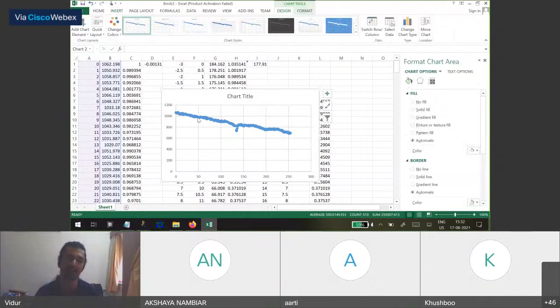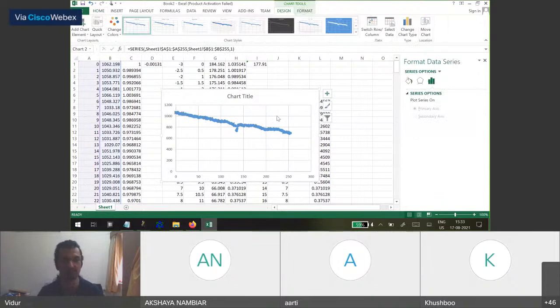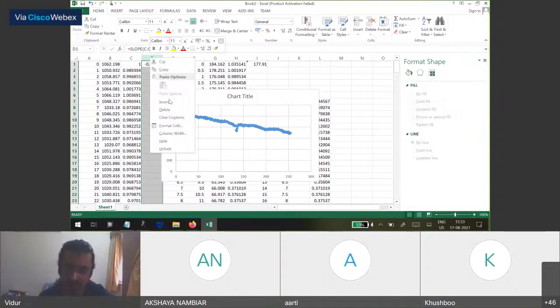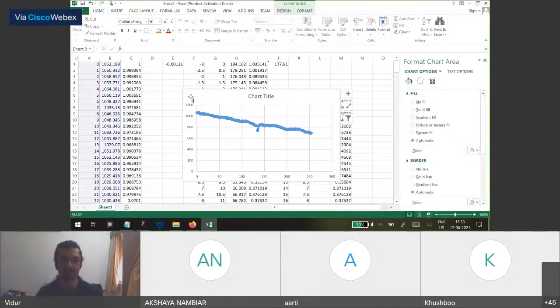When we plotted the acquisition bleaching, you can see that the slope is negative because the intensity was reduced. To correct for it, we have to somehow add this slope value to this curve such that the intensity gets normalized again. Now this is not something that you'll have to do for your experiments, but it's something I'm going to show you of why normalization of intensity is so important.